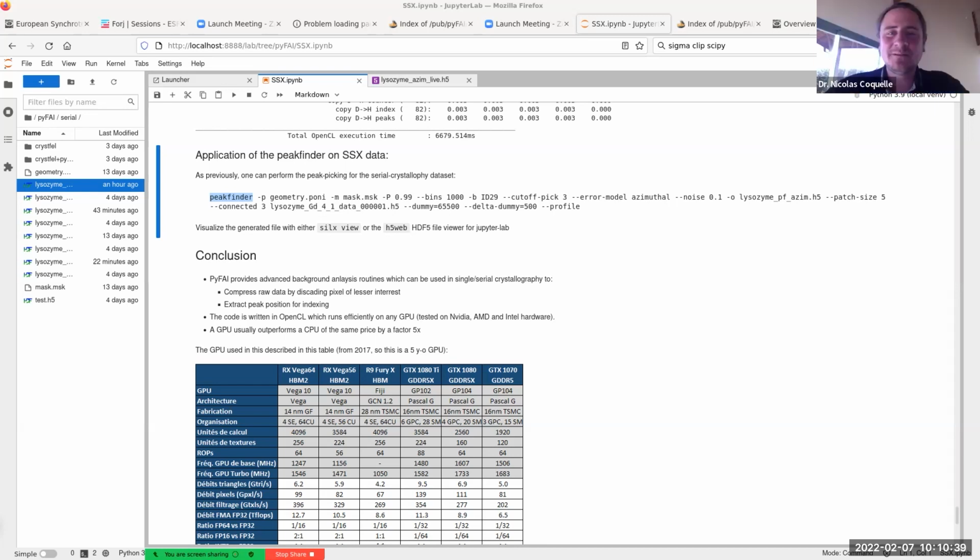What kind of material or sample are you scanning? Hydroxyapatite.